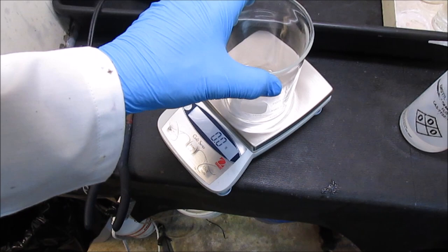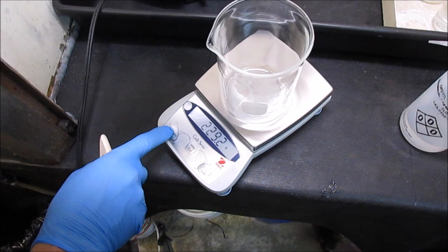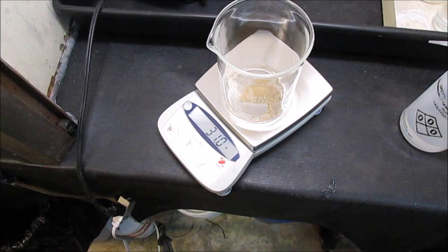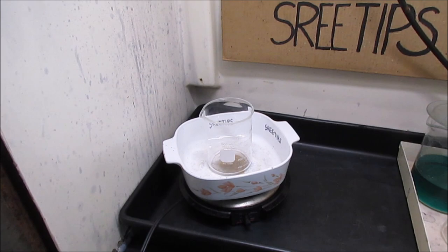gold into a 600 ml beaker here, and we're going to get a weight on it after the incineration. Let's see what we got now after incinerating. It should be the same. And it's 31.0 on the weight now. Now we'll move it over here and put it on the heat and put some hydrochloric acid on it.